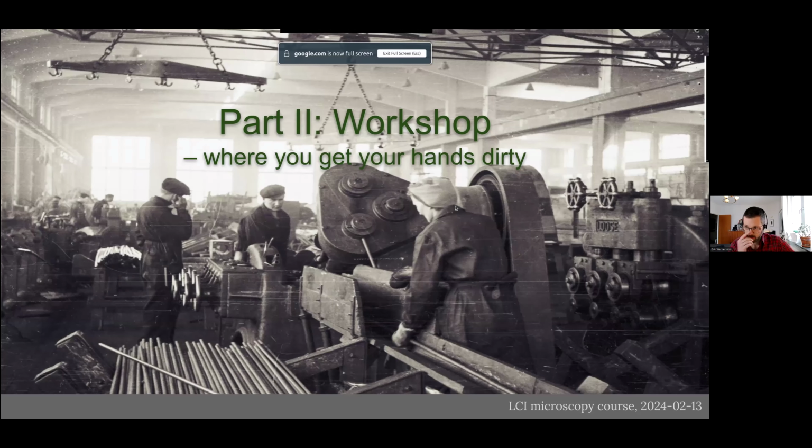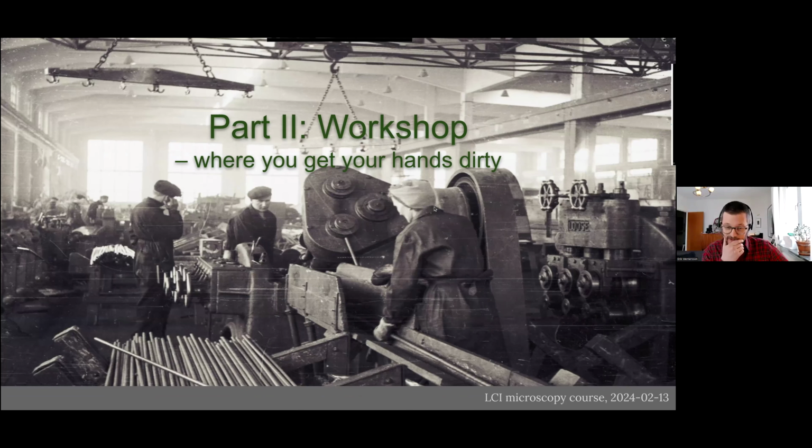All right. So in my view, the best way to get to know things is to get your hands dirty, to try it out a little, to get a feeling for it, get an intuition. That's really a good complement to the theory that you can read about another time.